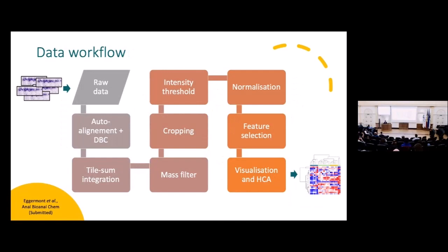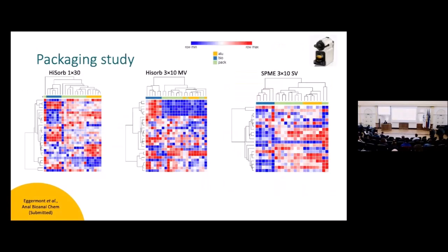So I display to you the data workflow here. I won't go into many details, but to make a long story short, we applied tile-based integration, and then feature reduction by random forest, followed by visualization and hierarchical cluster analysis. And so this is what we obtain.